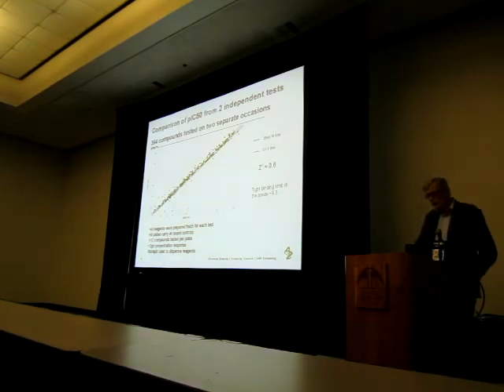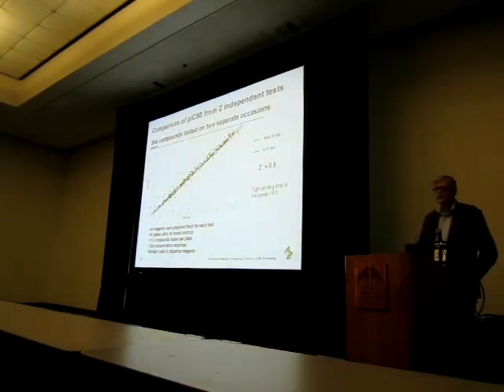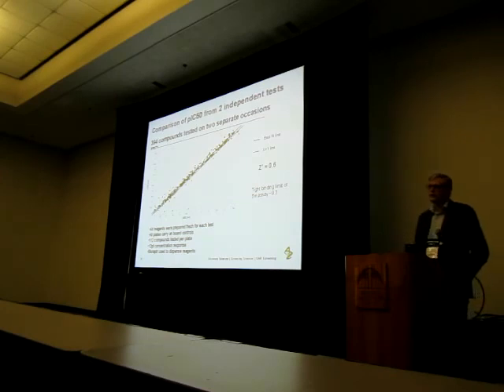So what you're looking at here are IC50 curves generated from 2 independent tests. The compound plates are produced twice, all the buffers are made up twice, and everything is tested completely independently. So nothing is run at the same time. And you can see from this that the data correlates between the two runs pretty well. The red line is the XY line, and the black line is the best fit line. The two don't quite sit right on top of each other. But that probably is a good thing, because then you don't think I just fixed the data. So the fact that they're slightly off center is probably a good indication that we were doing quite well.